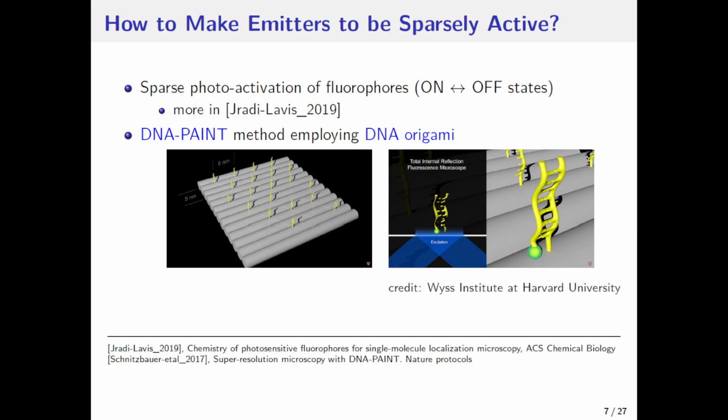Historically, the way people do it was based on the fact that some certain fluorophores can be activated or switched to the active state using a light. They can be photoactivated, or, for example, in our group, we use a DNA-PAINT method based on DNA origami technique.